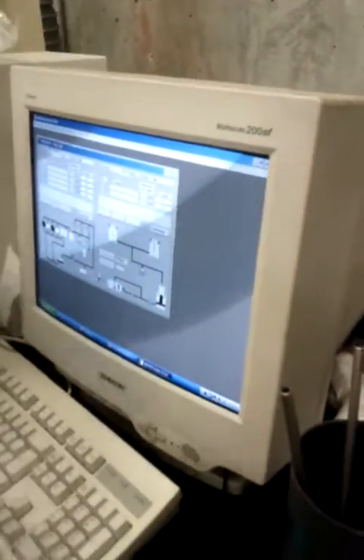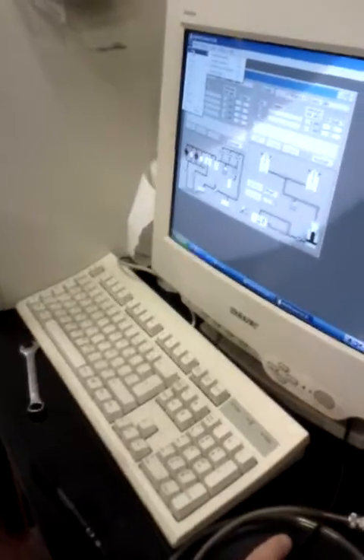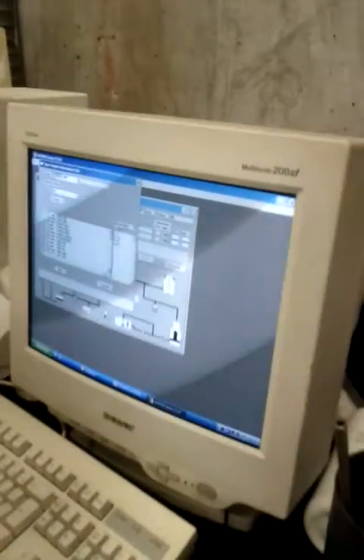So first thing, to create the sample in the software, we have to open the software. We go into File, Open, and Sample Information. Here we have to write a name. So maybe it's 5, 2.